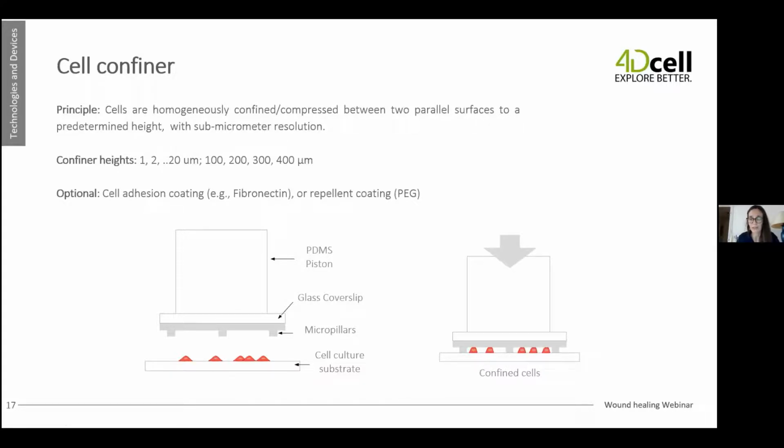You can get very good images and live videos of cells at a very close level, for example, to study events taking place at the cellular membrane, but also to look at how the organelles move, if something happens there, and also for nuclear deformation and cell migration itself.